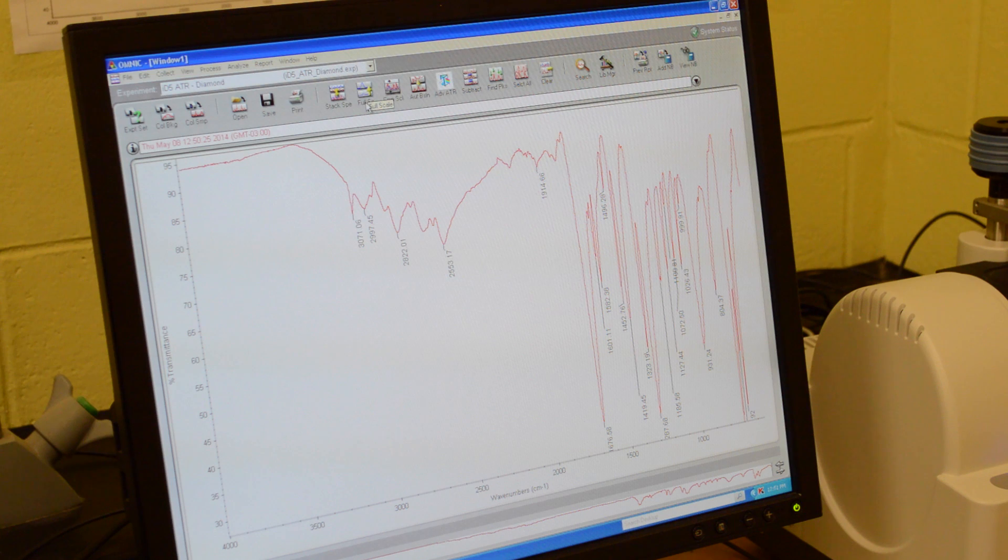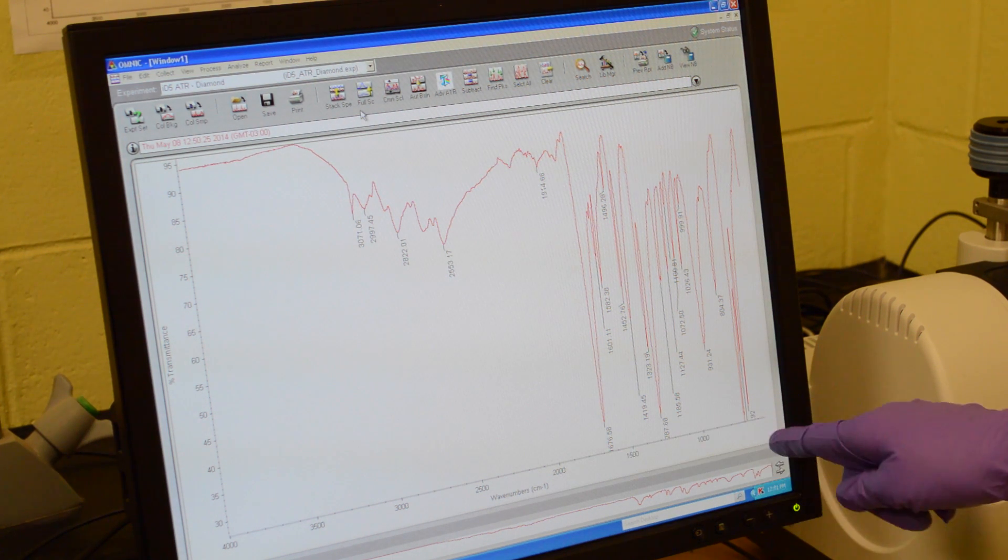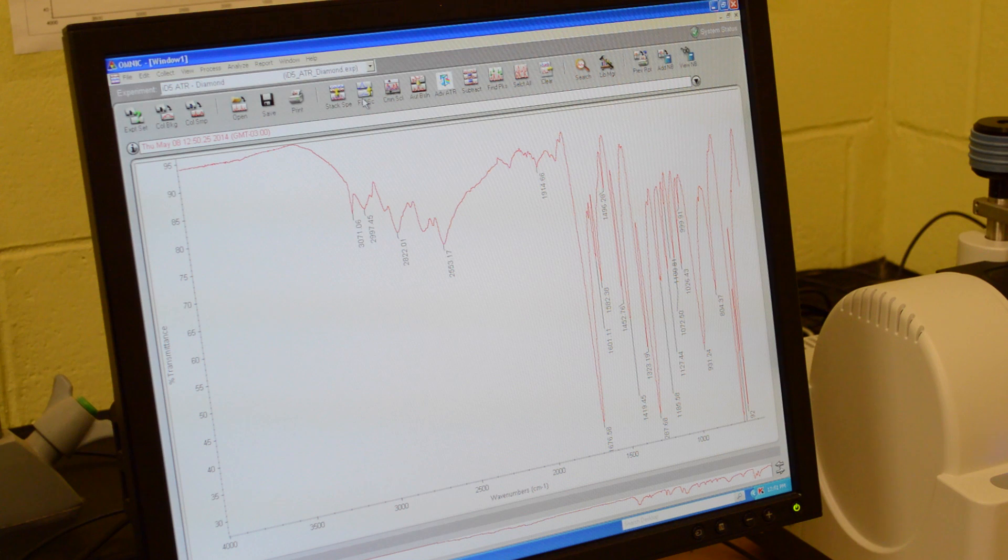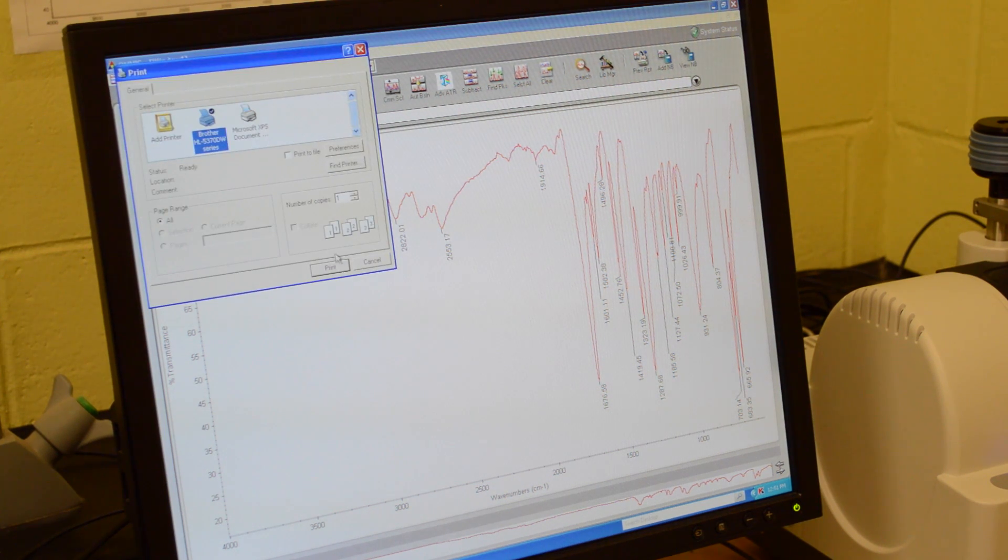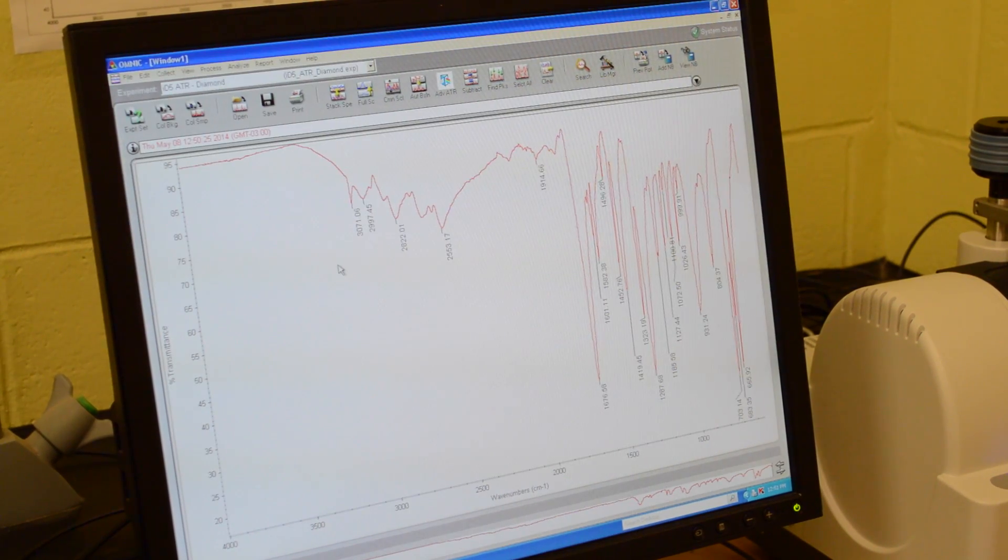The last thing you're going to want to do, especially if you're printing, is press the full scale button. As you can see, some of the measurements have been cut off due to the scale. If you press full scale you'll be able to see all of the wave numbers. Then you can just press print, and it will come at that printer right there.